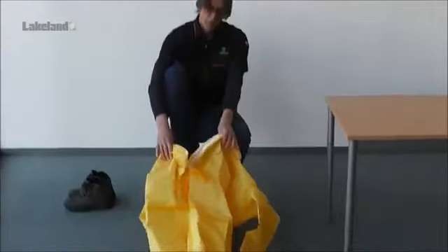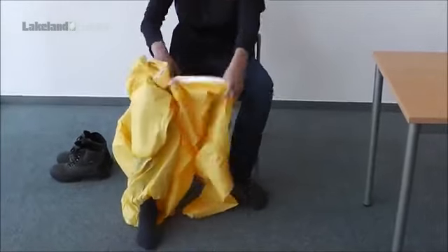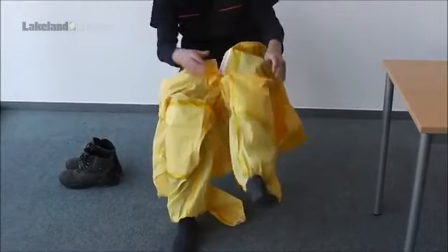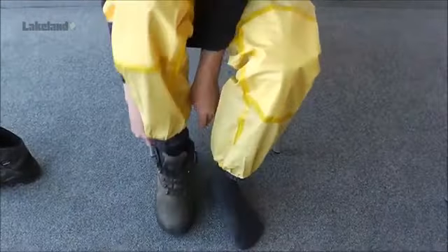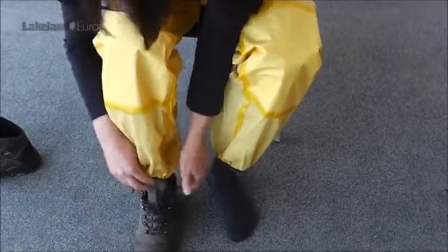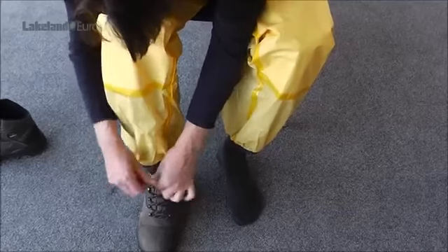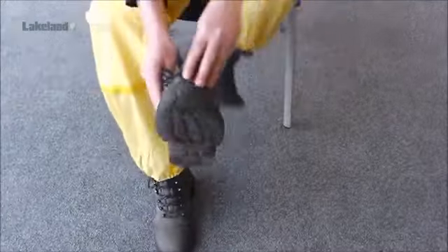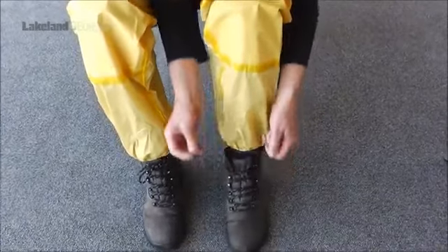It is also much easier to sit down for the first part of the donning procedure. In a seated position, push each foot into the corresponding leg of the garment. Remain seated whilst you put on your safety boots.